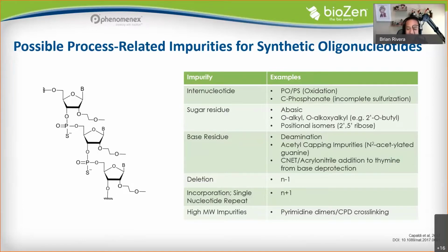And this is not even mentioning the standard N-1 and N+1 impurities that one has to characterize for any solid phase synthesis. And there's also higher molecular weight impurities as well. So those are in consideration as well.